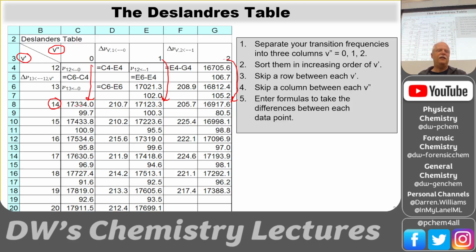So if I were to take the difference between those 3 peaks, those 3 transitions, I get a measurement for the ground vibrational state, right? These are the vibrational differences between 0 and 1 and 1 and 2, because they all 3 have the same upper state. So the only difference between those arrows is the ground states. And that's kind of neat.